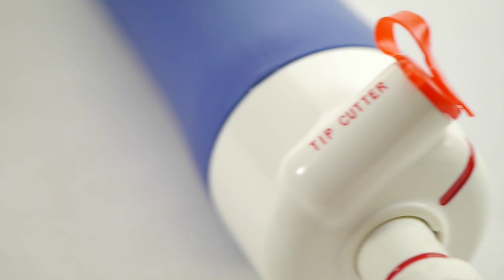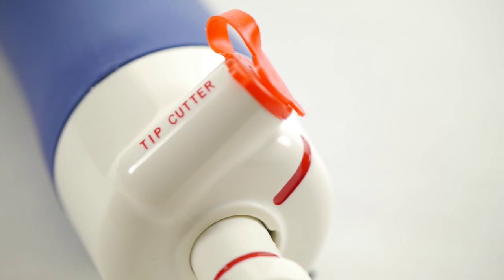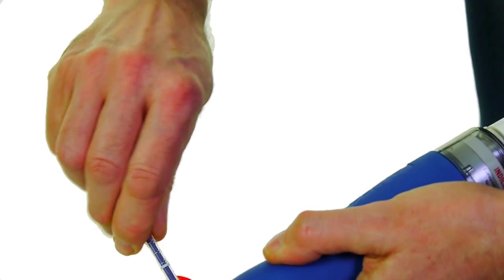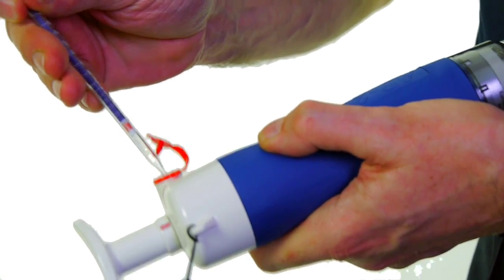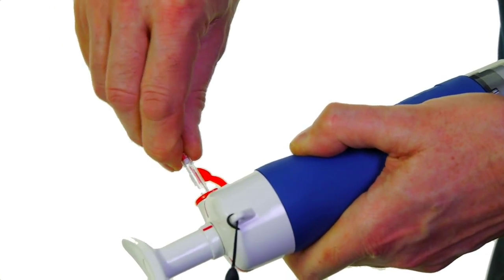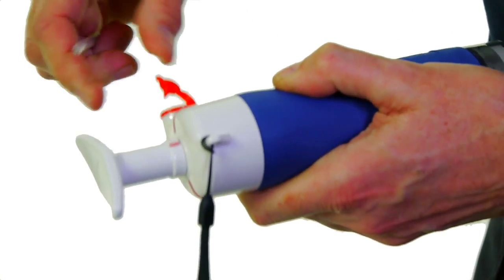It's a nice simple four stage system to use. First thing you do is using the cutter that's built into the tube, cut the ends off of the tube. Simple as that. That tube is now ready to use.